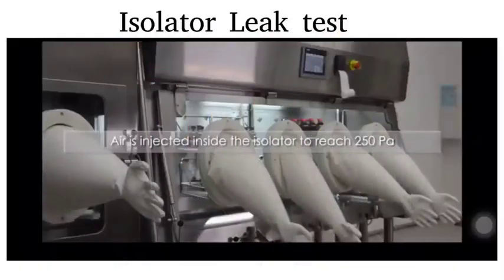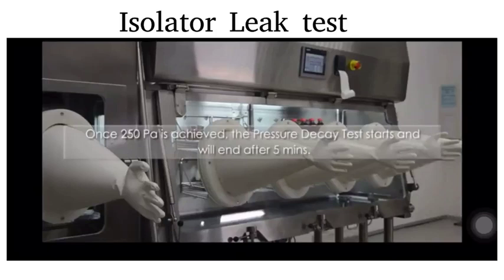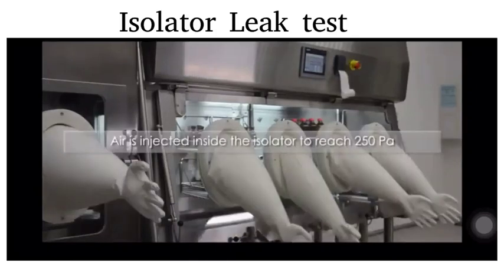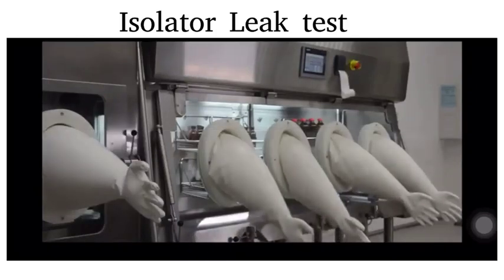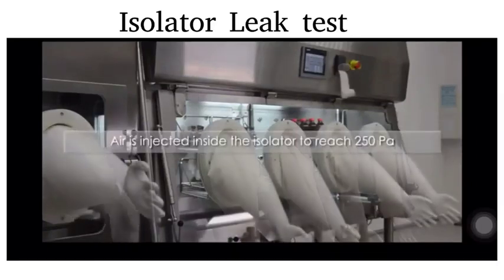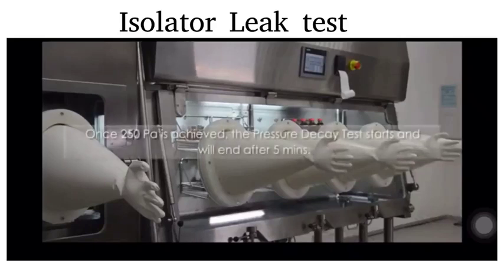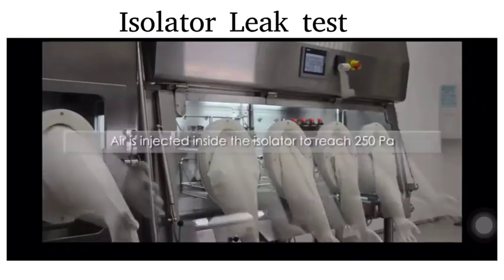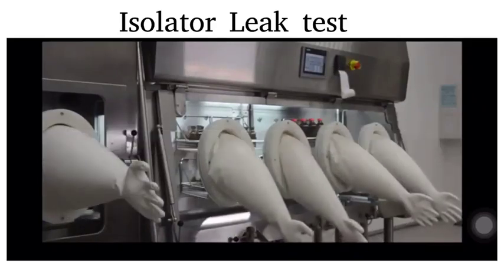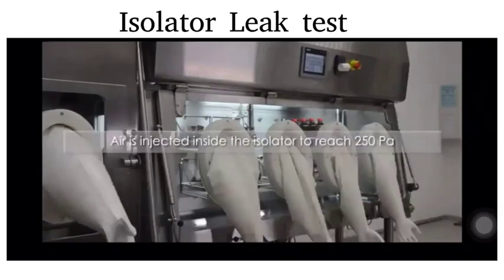Isolator doors are closed after loading of articles, and the isolator chamber is tested for the leak rate via pressure decay. Even open isolators must be capable of being rendered sufficiently leak-tight during the decontamination process so that occupational safety and health requirements can be met. After a successful isolator leak test, all the gloves are either inflated using air or arranged in a manner that the entire surface of the gloves can be exposed to VHP contact.